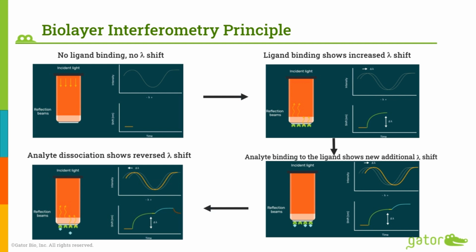You take the biosensors to the next well, where you have an analyte in the solution that binds to the ligand that it captured. Then the refractive index pattern changes, so you can see the further binding event happening as well. So you can build layers of information.